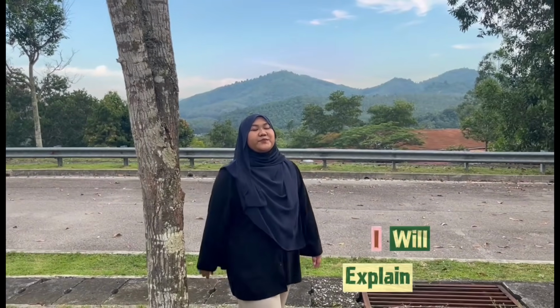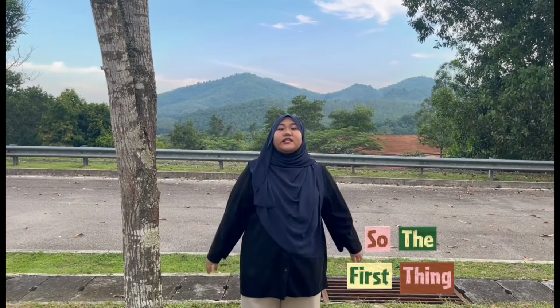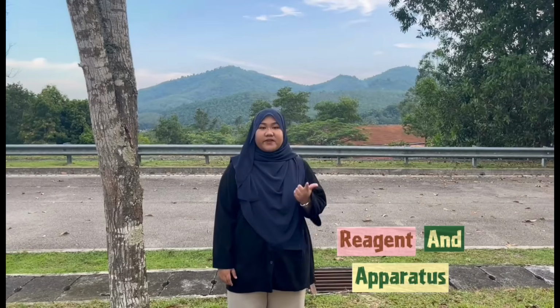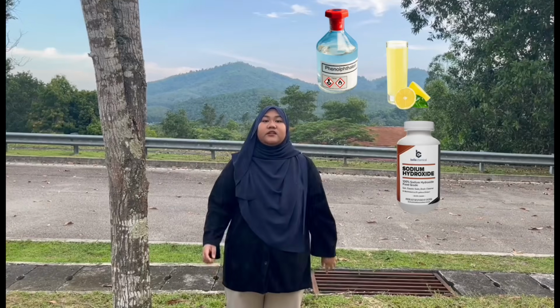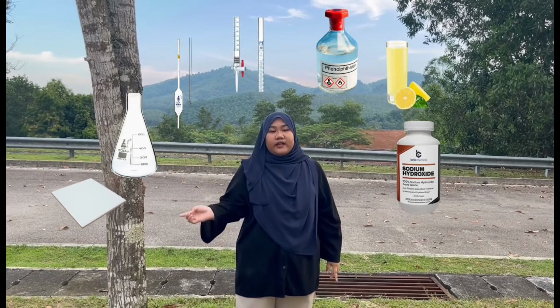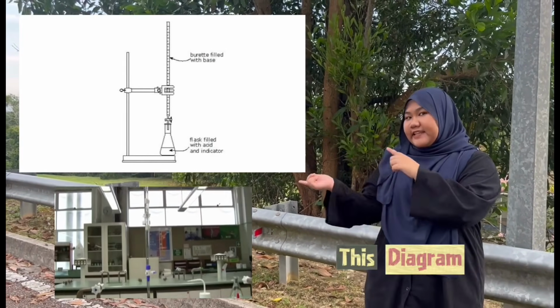Okay, now I will explain the titration experiment between citric acid, which is lemon juice, and sodium hydroxide. The first thing we need before we start the experiment is the chemical reagents and apparatus, which are sodium hydroxide solution, diluted lemon juice, phenolphthalein indicator, burette, pipette, conical flask, white tile, and retort stand. First, set up the apparatus like this diagram.